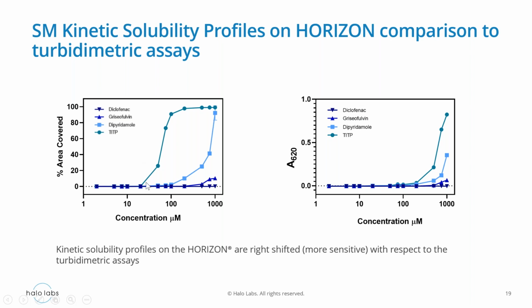And this makes sense because you need a lot of material to start precipitating before you can observe it using a spectrophotometer. But when using a microscope, when you can count individual particles, anything that rises above the particle threshold, you will immediately be able to detect, even if it's 2 or 3 particles above your threshold.